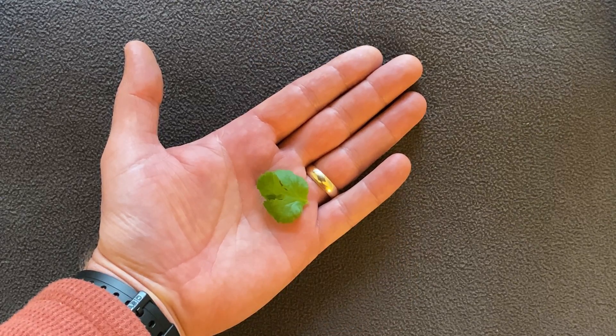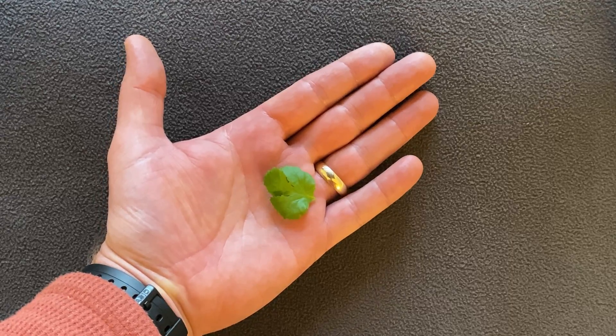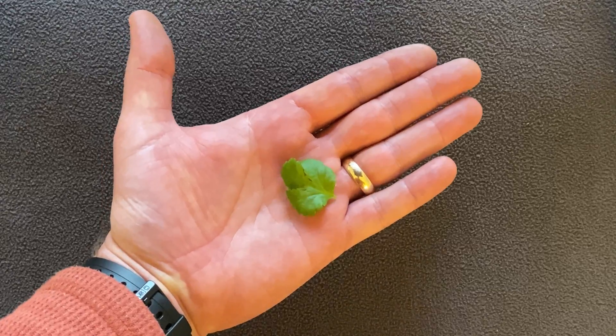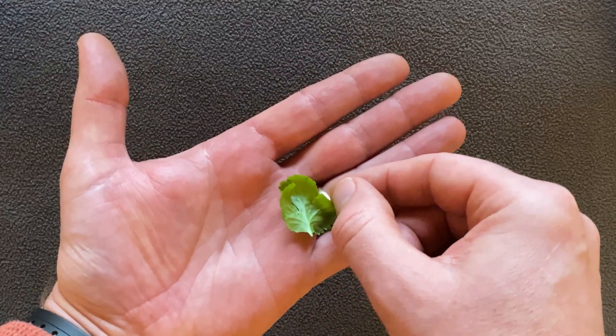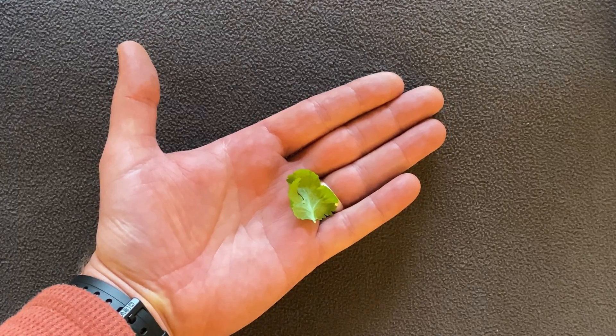Here we have a small coriander leaf. I'm going to put on a couple of test photos of this leaf using this microscope so you can see the rough size of the leaf, the underside of it as well, and then you will see what it looks like 200 times larger.